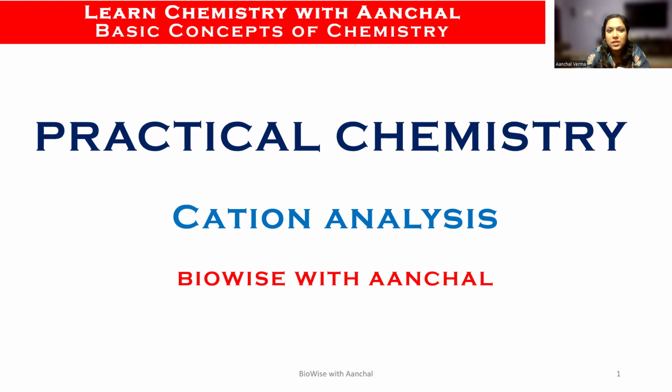I hope the examination is going on well, and a little bit of topics here and there must be left in chemistry. Now I have come with a very important topic for chemistry, which is called cation analysis. Depending upon what color is being produced by which metallic ion, you can identify those ions. Okay, so let us proceed.